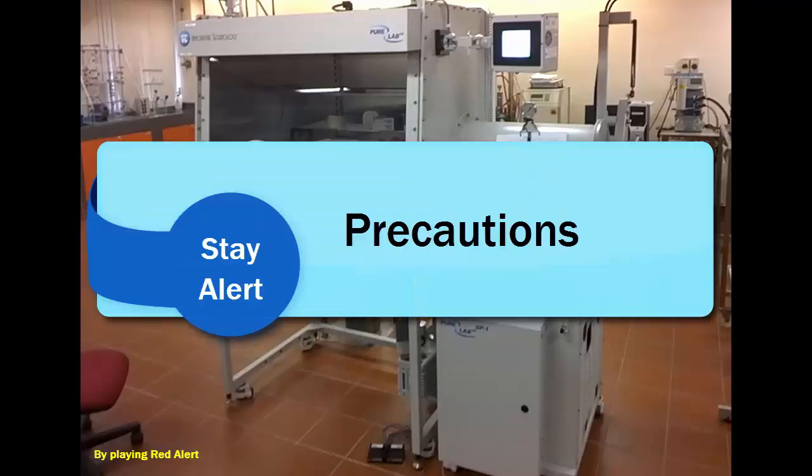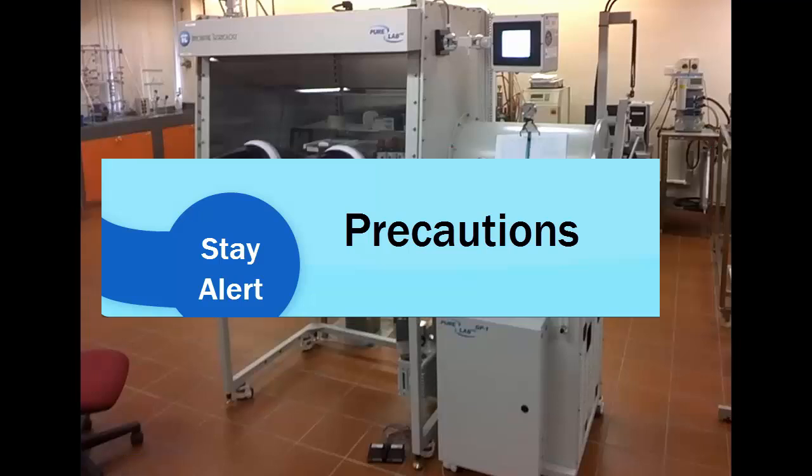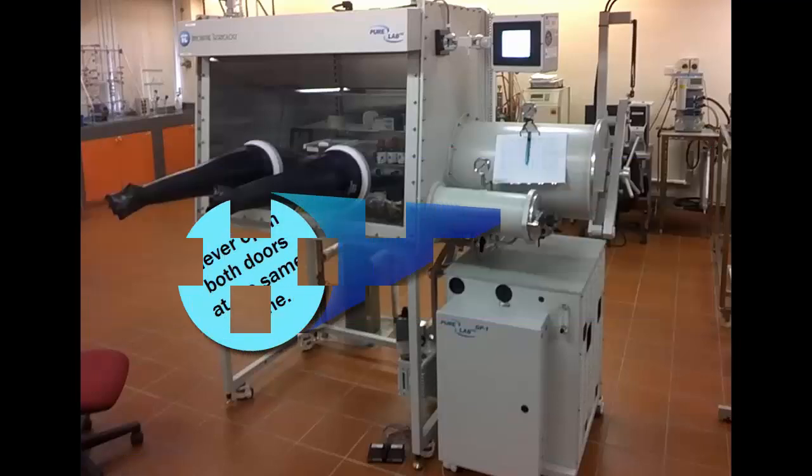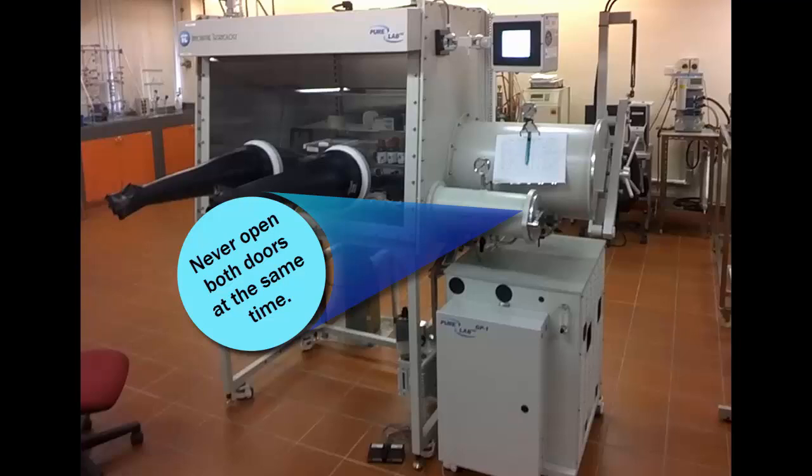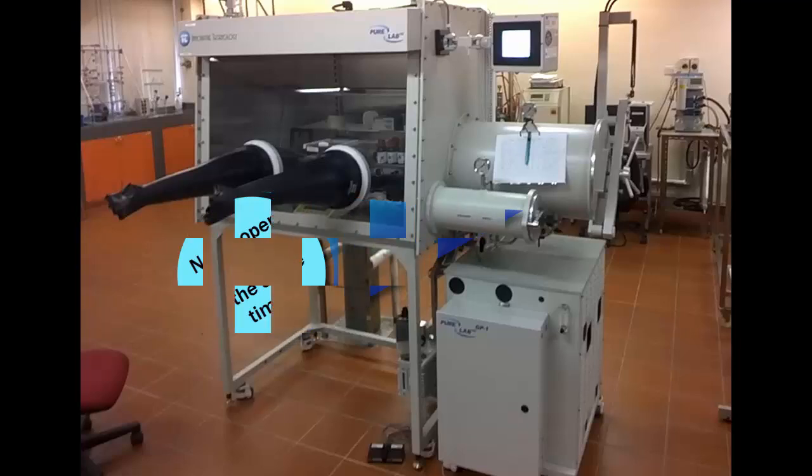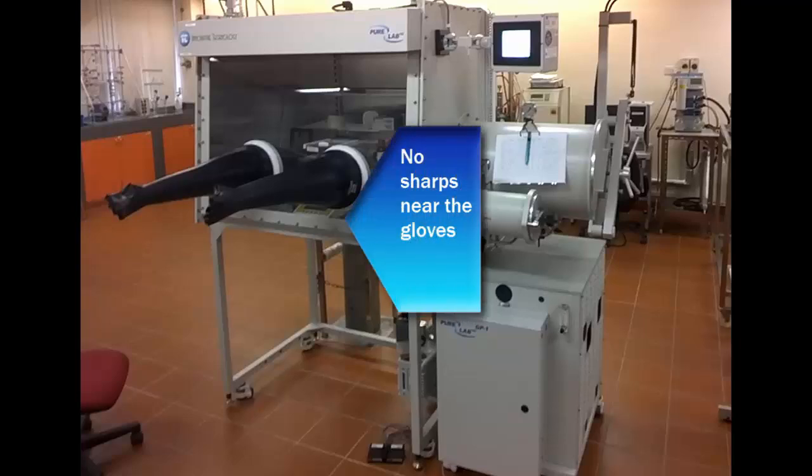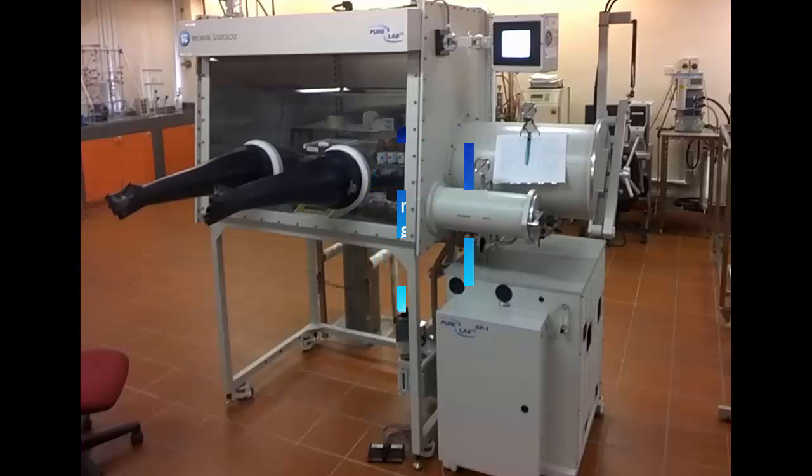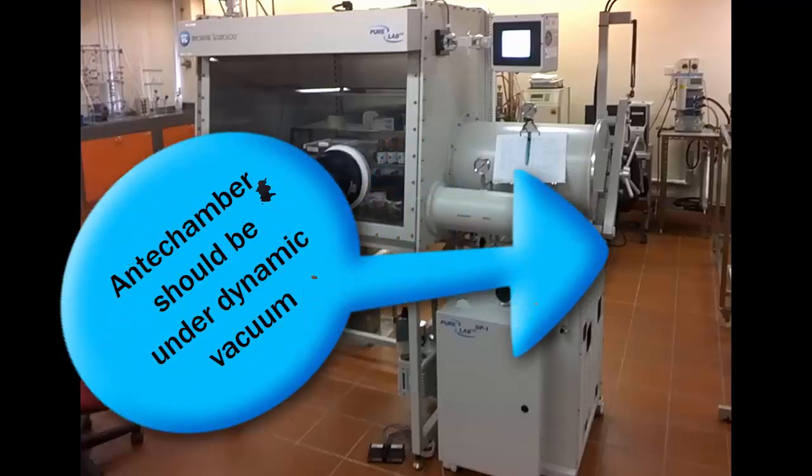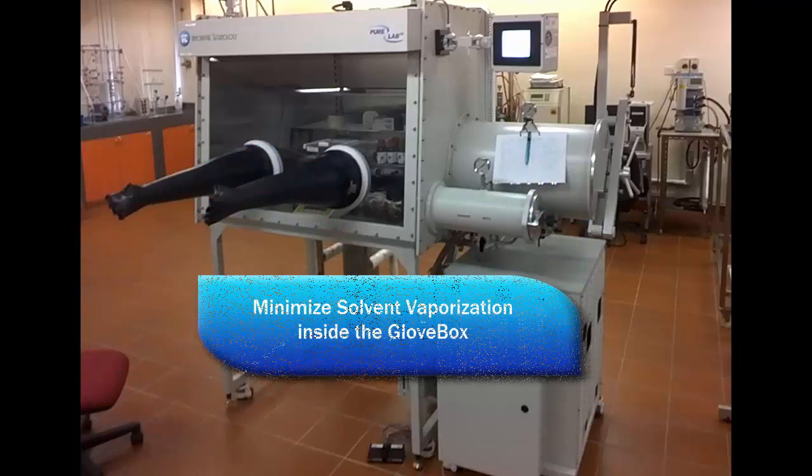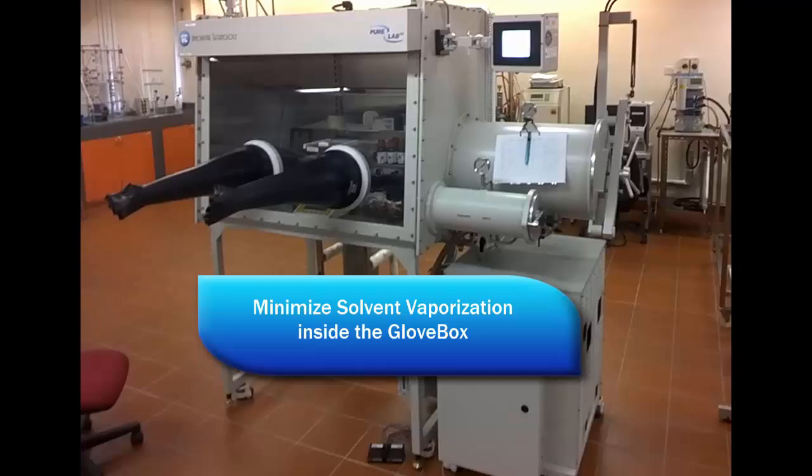There are several precautions when you are using the glove box. We know that the glove box is an isolation device, so never open it to air, meaning that you do not open both doors of the same antechamber and moving things into the box without pumping. No sharps should be near the gloves. We should minimize the use of sharps inside the box and use extreme caution when we have to do so. And the antechamber should be under dynamic vacuum, which should minimize solvent evaporation inside the glove box.